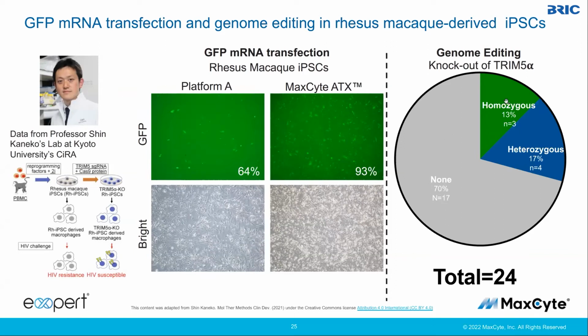They couldn't get any homozygous knockout clones, and they're trying to knock out TRIM5 alpha here because I think they were looking at HIV susceptibility studies. But here, in the first try, they were able to get homozygous clones that they could take forward for their experiments, where they were stuck for a year. So I think that efficiency, of course, is higher now. They've been able to optimize a little bit better, but I just wanted to point out it's not limited to just human iPSCs, but also non-human primate iPSCs.